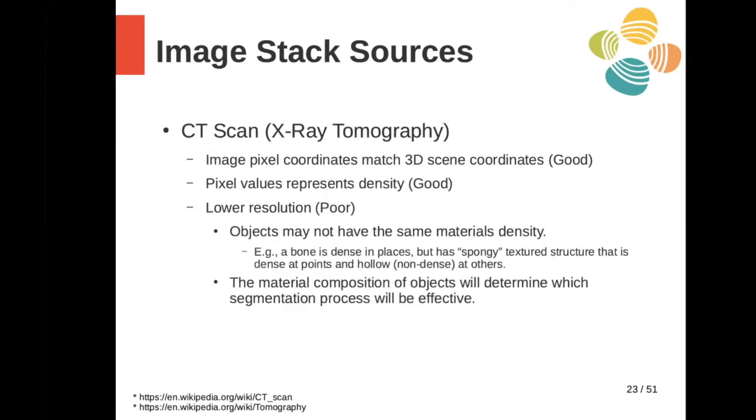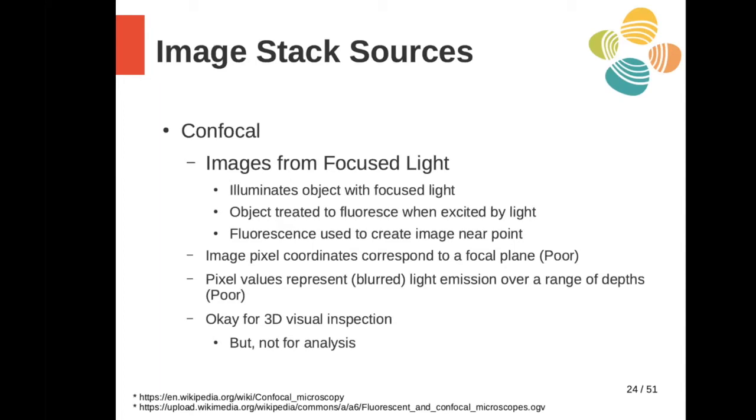Another example of this can be CT scans, which are also a type of tomography. So they have, again, similar sorts of qualities. One issue, though, might be lower resolution. And so it depends what you're trying to look at. If you're looking for very, very fine detail, it just might not be there. Finally, for our microscope sources is the confocal.